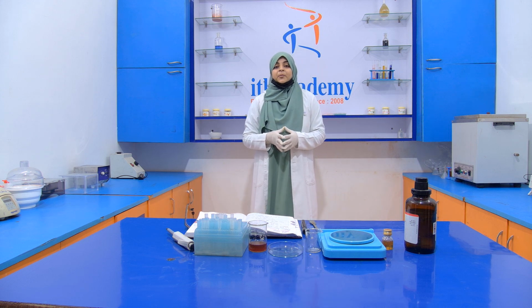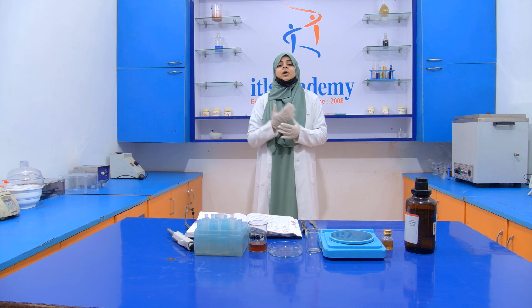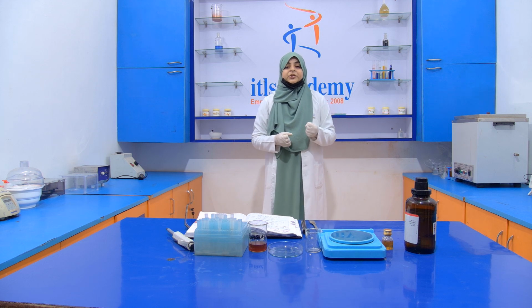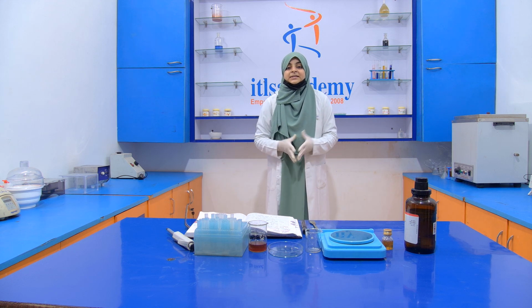You also have to avoid inhaling the fumes generated from the concentrated solution. Take care of your eyes too, because concentrated HCl can also damage your eyes.